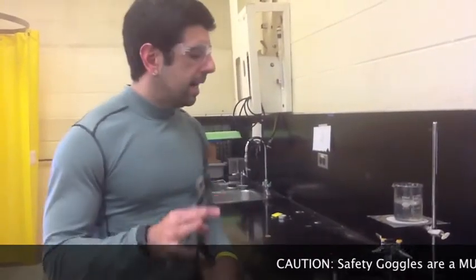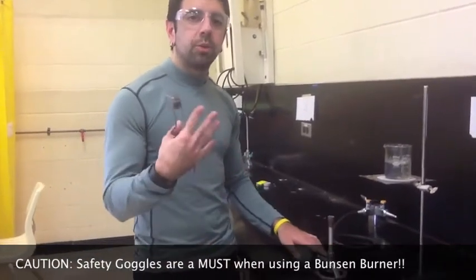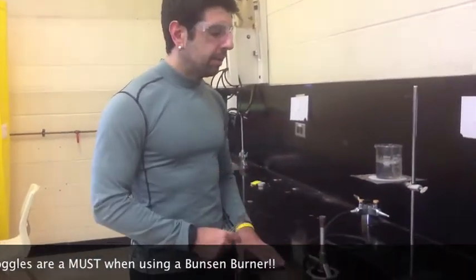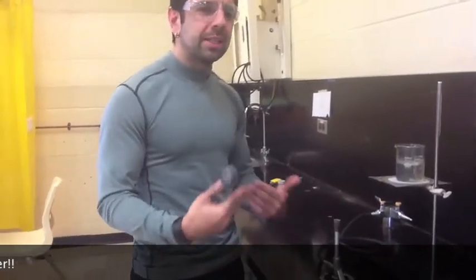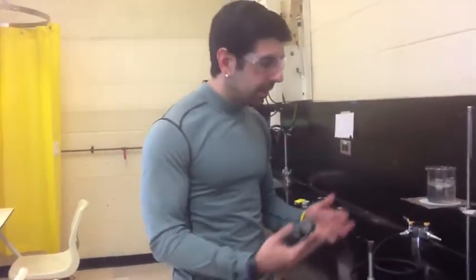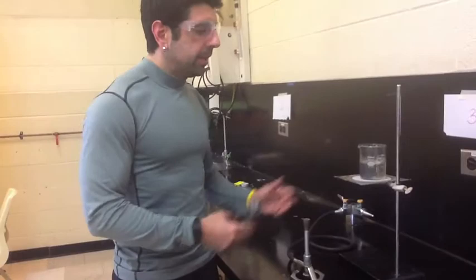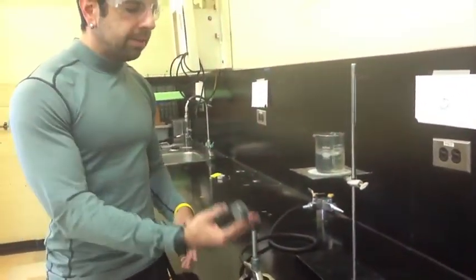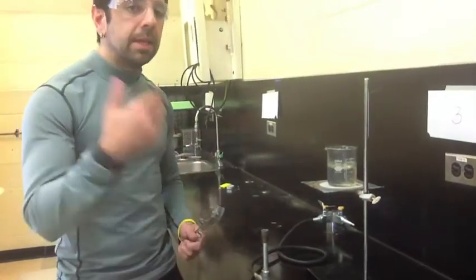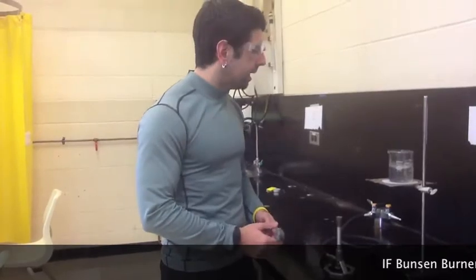This station, again, is not the most exciting. The whole premise of this one is to demonstrate the burning of the gas within this Bunsen burner, and really for show, to show what kind of reaction it is. It's going to be heating water. That's all we have in this beaker. In the write-up, you're going to tell me, in a balanced chemical equation, the formula of the reaction that's taking place.